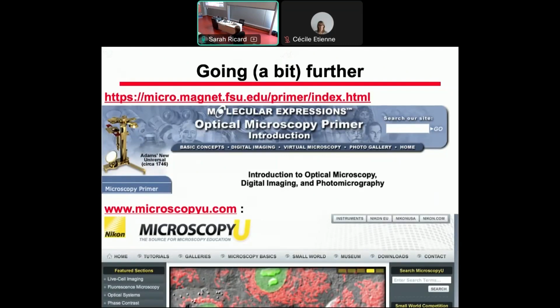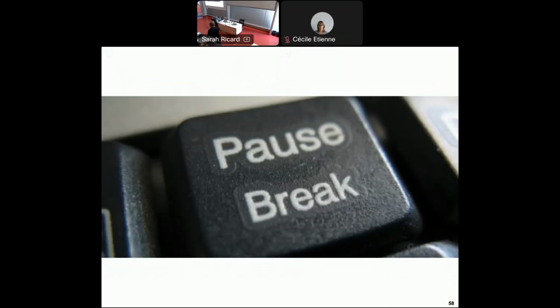They are very nice now. For example, you have Java applets, where you can change the bias and the shear to see how the image will change, and it's very nice to understand how these classical microscopes work.